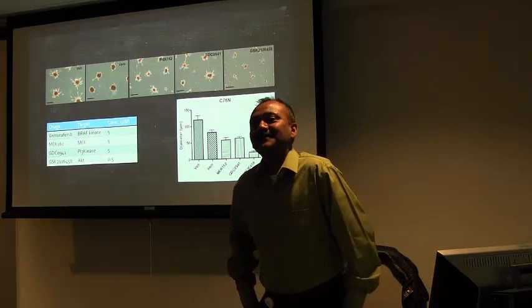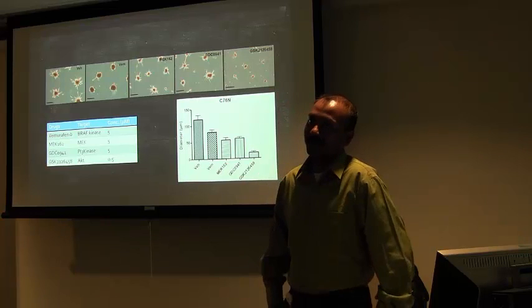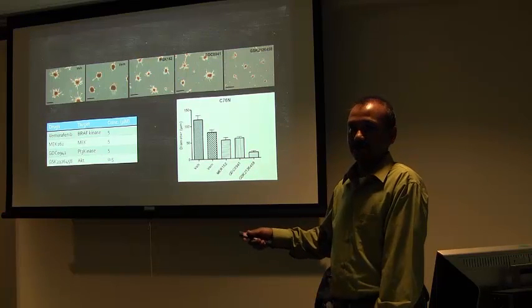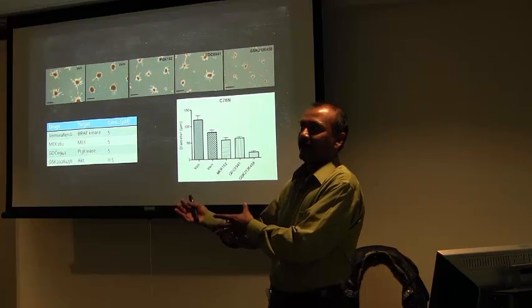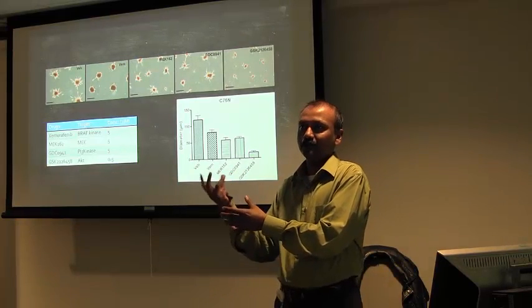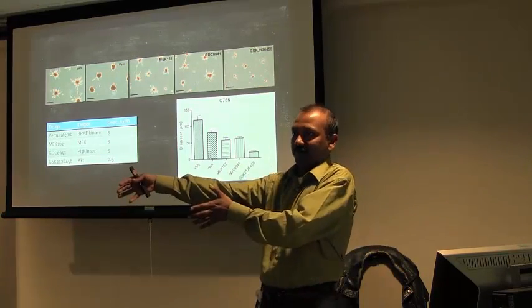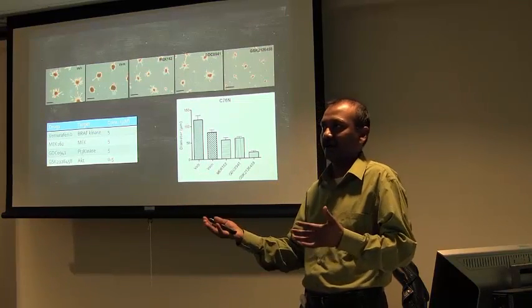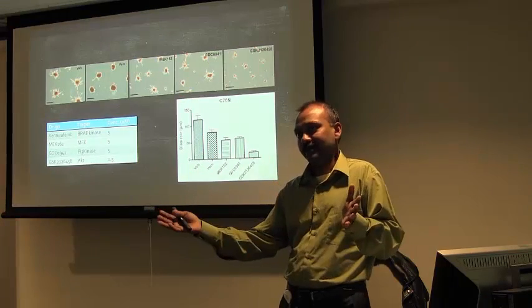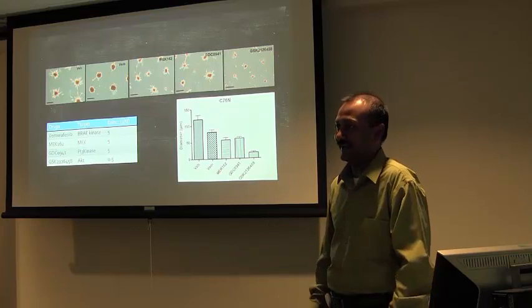Is there any difference in gene expression when you compare a spheroid form versus monolayer form? Oh, yeah. I cannot give you the data from my cells because we haven't done that in these cells. But in other cancers where people have grown monolayer versus spheroids, like Hans Clevers in Netherlands, who made these organotypic colospheres from colon cancer, they did a whole transcriptome analysis of monolayer versus the spheroids, and there are many genes that are up or down regulated that gives them an idea how these cells behave. They compared the parent tumor, monolayer, and spheroids, and definitely the spheroids closely resemble the parent tumor. But we haven't done that yet. We are still starting on that.